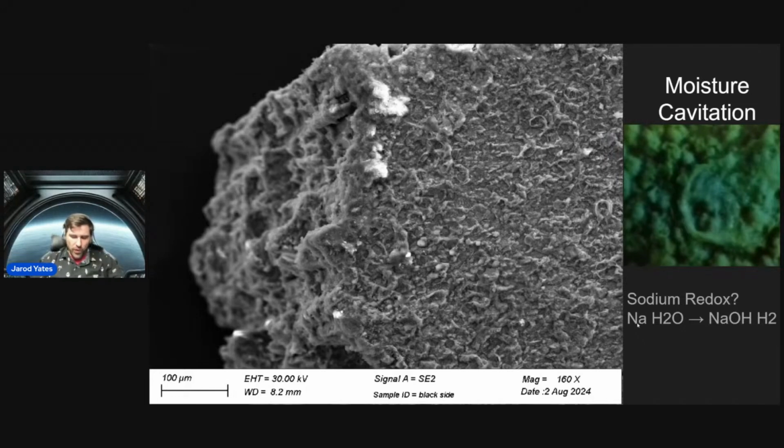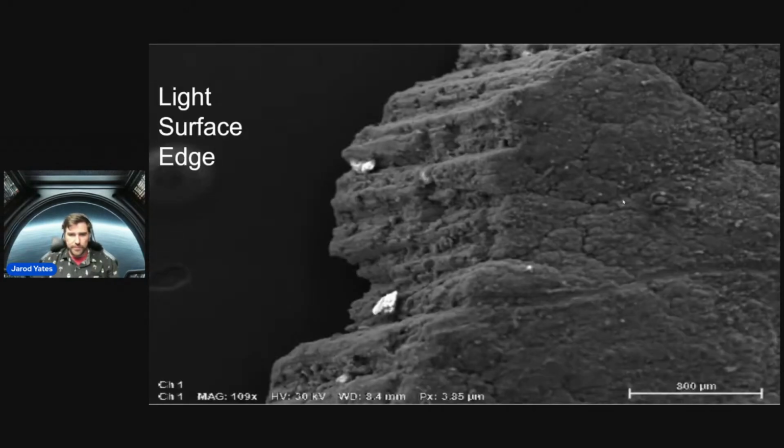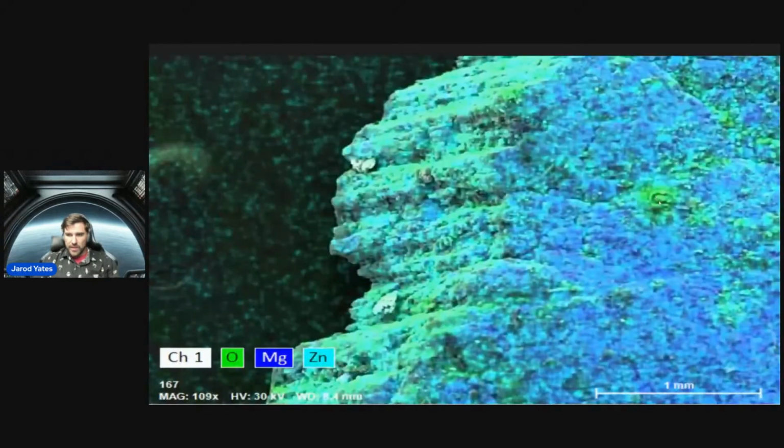Now, way towards the end of the talk, we may have noted some sodium on it, but once again, it was down at the threshold. So take with a grain of salt, so to speak. It seems more like it's the zinc and magnesium that's getting converted into the hydrogen. Here's another zoomed in example of one of those cavitation zones. So on this one, right here, this is an obvious cavitation zone, as we can see from the oxidization that has occurred in that area.